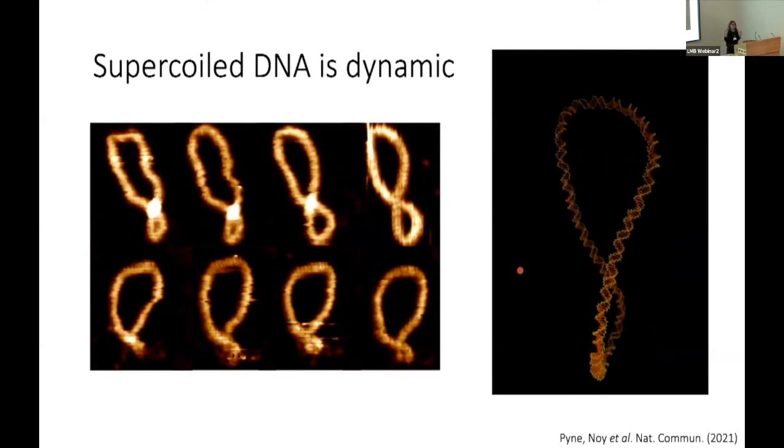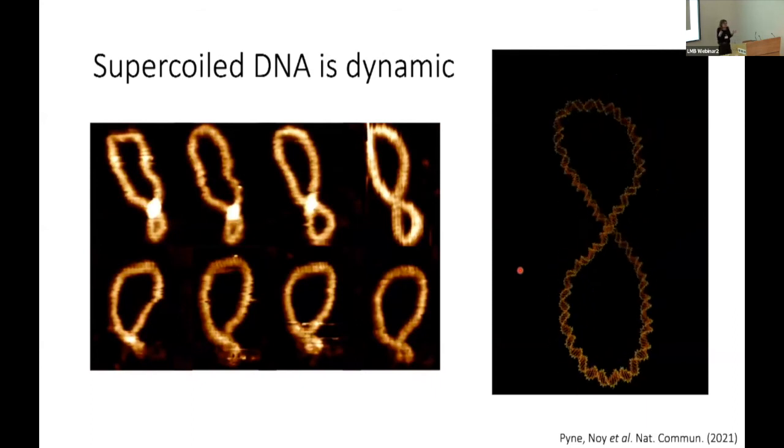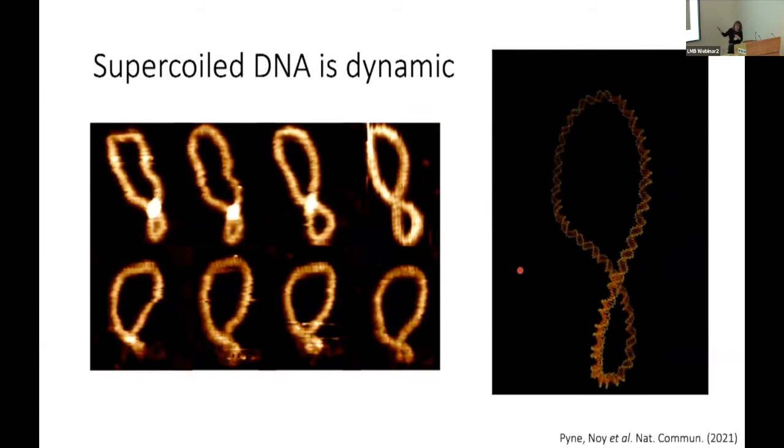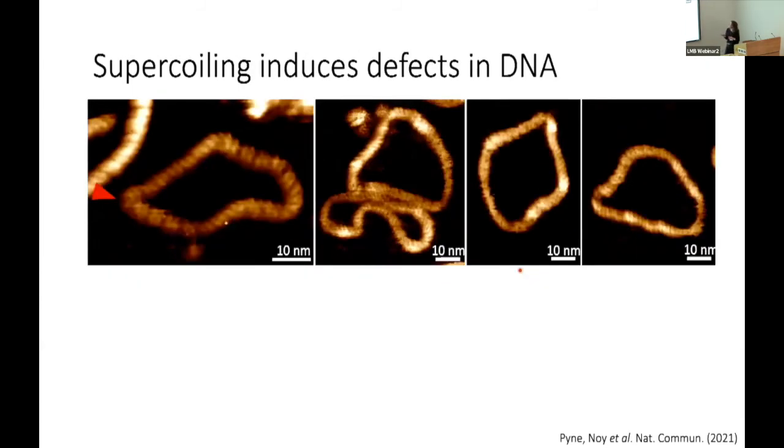And for this, you need to remember that this is one of the most negatively charged molecules you can get. So it's incredibly negatively charged. So it doesn't want to be near itself, even with calcium ions in solution. And again, we see really, really good correlation between them. And so what happens as that DNA is moving itself around, trying to writhe itself down to its lowest energy state? Well, what happens? It seems to actually spontaneously induce defects in its own structure. And this isn't, sorry, we accidentally defrosted your plasmid, or we left it in a freezer with lots of different enzymes.